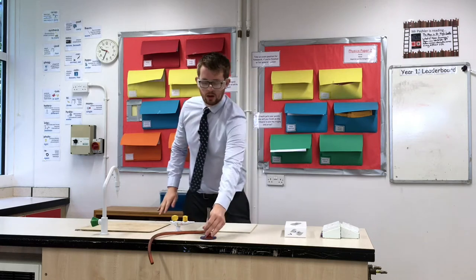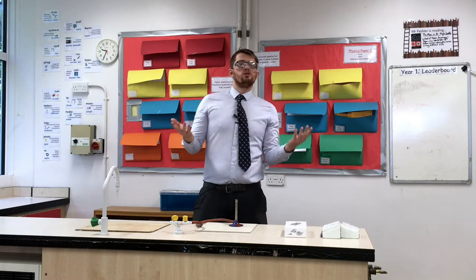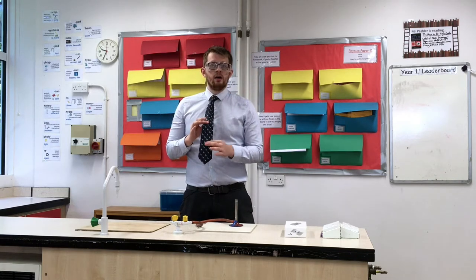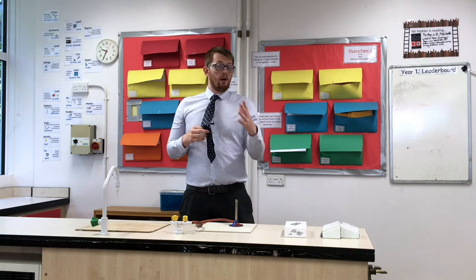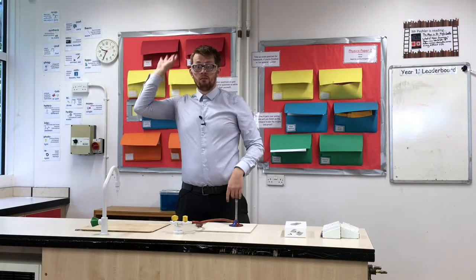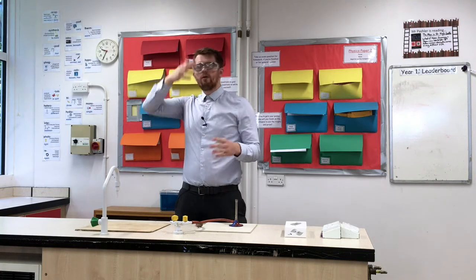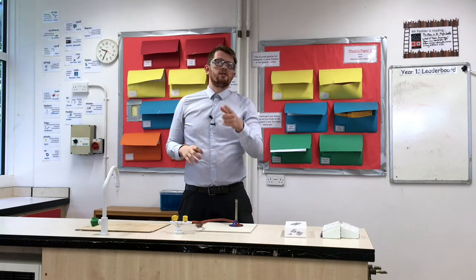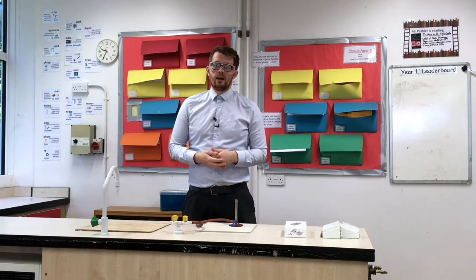Heatproof mat down, Bunsen burner on, and then the gas tap. Now, I'm currently wearing a tie — often people might have their ties tucked into a jumper but I don't, so I'm going to take this tie off. Also, if you have long hair make sure it's tied up in a ponytail. This means your hair and your ties aren't going to sway into the Bunsen burner and catch on fire.